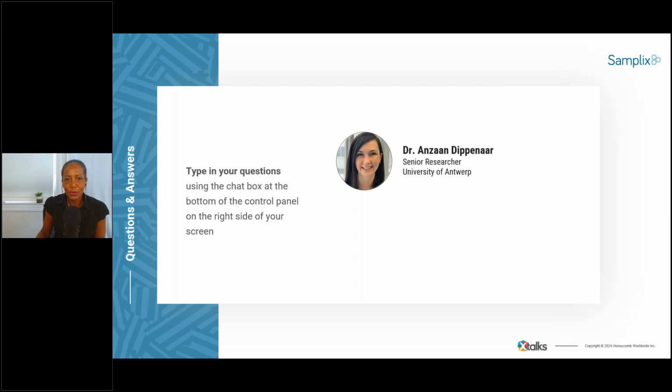This audience member is asking, how does droplet-based whole genome amplification compare to other amplification techniques for low-input DNA samples? What are your thoughts on that?